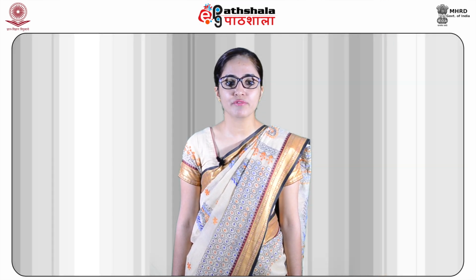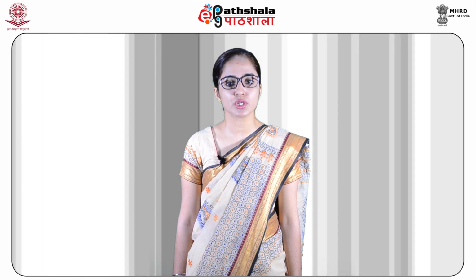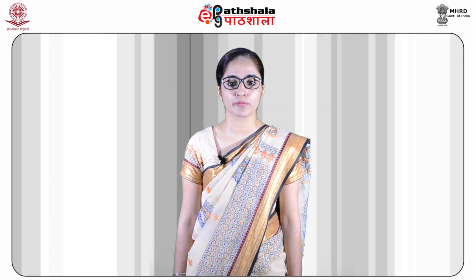They are especially valuable techniques when the structure of complicated natural products is to be considered and the conformation of biomolecules has to be determined. Out of these several experiments, two find the most frequent application among NMR organic chemists. These two are proton-proton correlation spectroscopy, abbreviated as COSY, and 13C proton correlation spectroscopy, that is heteronuclear correlation, also known as HETCOR.